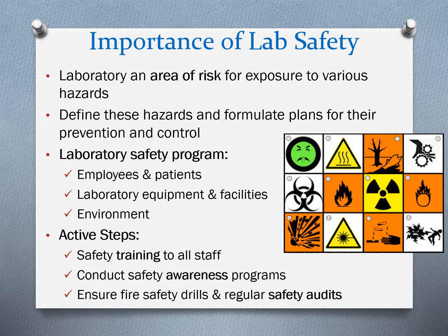A laboratory safety program protects not only the employees and patients, but also the laboratory equipment and facilities, as well as the environment. The active steps which must be taken are: provide safety training to all staff, conduct safety awareness programs, and ensure fire safety drills and regular safety audits.